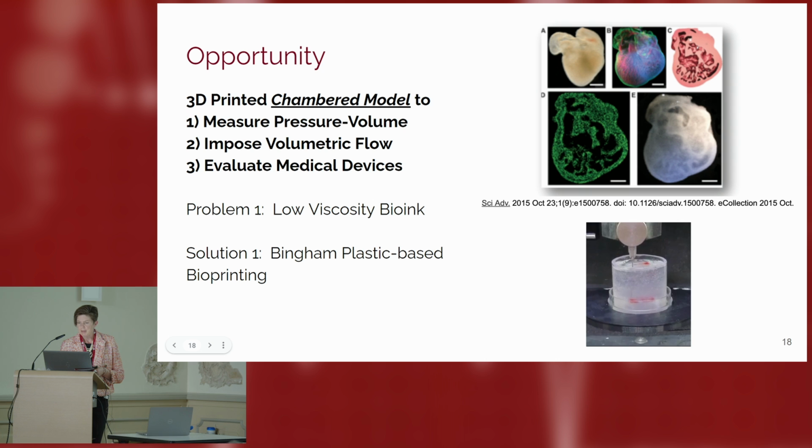So this is just sped up, and it's actually upside down, so the vessels are at the bottom, moving up toward the apex at the top. And again, we're using gelatin methacrylate plus our optimized ECM formulation for cardiomyocyte specification.